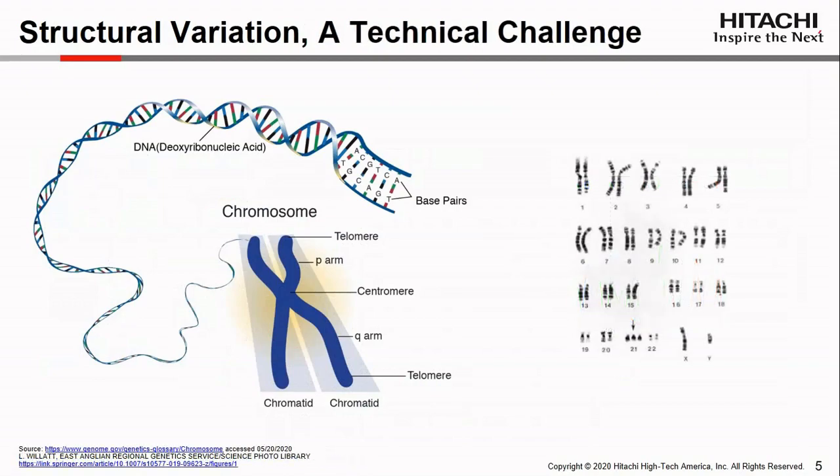On the other end of the spectrum is karyotyping. This technique predates sequencing technology by many decades, yet still remains in standard practice today. It involves the cytogenetic practice of visually analyzing chromosomes under a light microscope. In addition to being used to ascertain chromosome counts, judge the position of centromeres, and note differences between the sex chromosomes, karyotyping can also identify banding patterns indicative of very large structural variation.